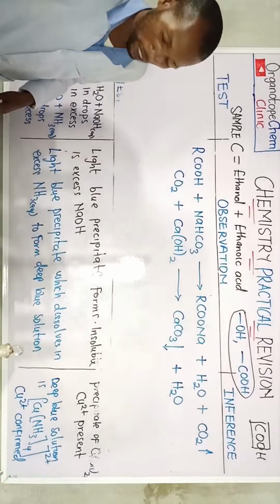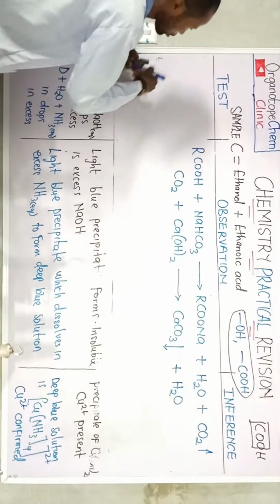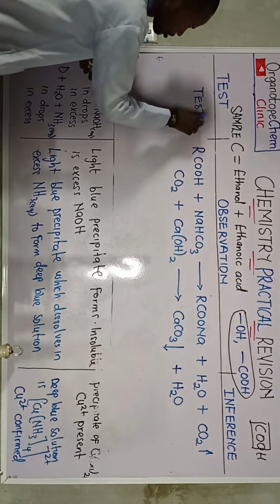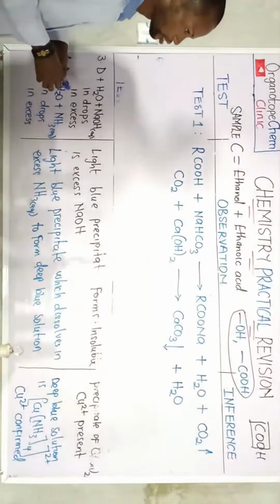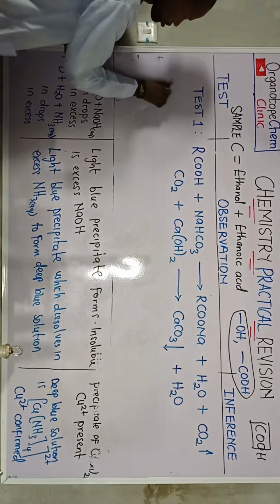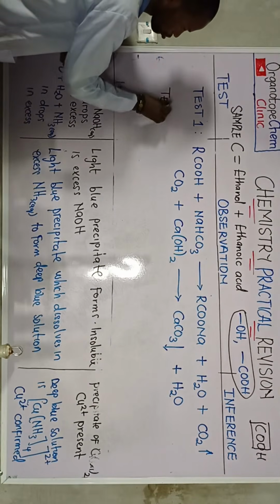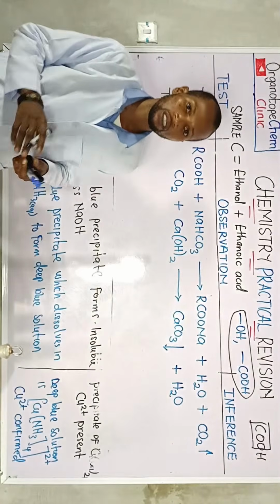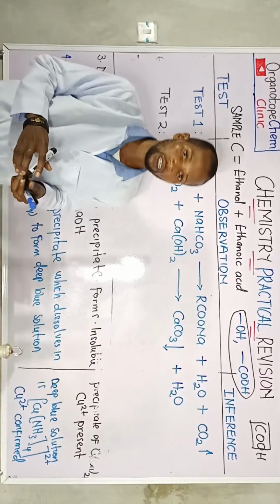For those of you that are just joining, here is the reaction for test 1. You'll be asked to pick a reaction, okay? That's the reaction for test 1. Now the reaction for test 2. We all know that test 2 is the esterification process, esterification.